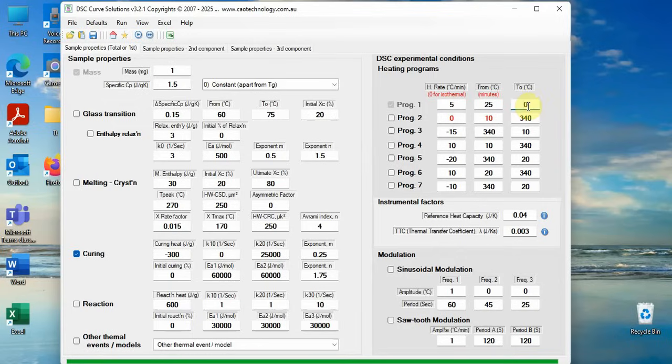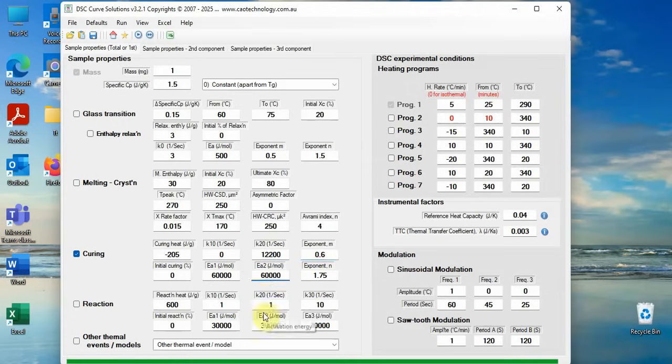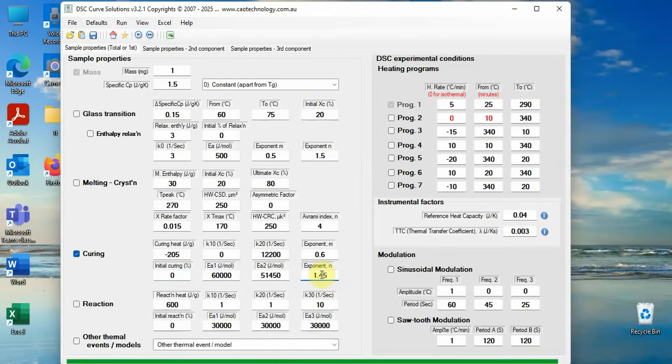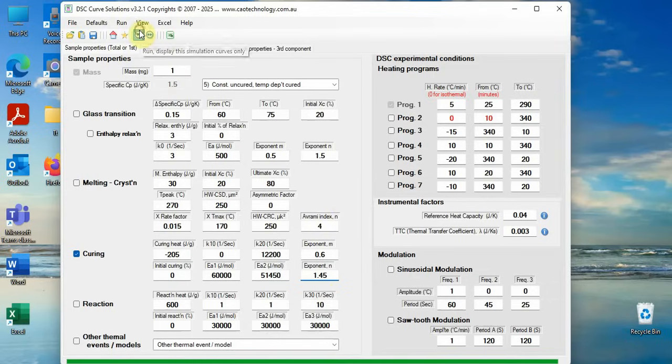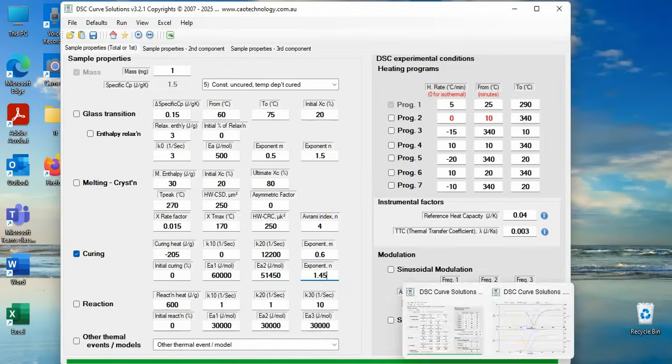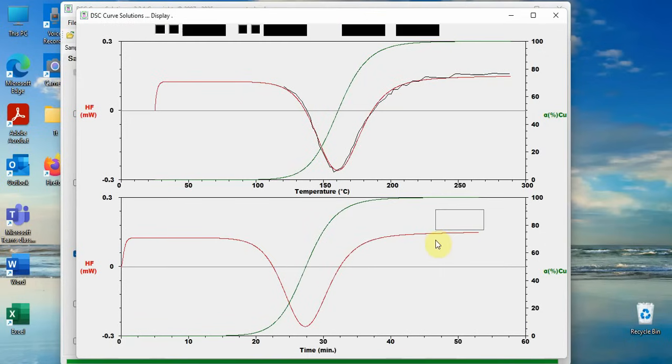You then adjust the parameter according to how simulated DCS curve departs from the DSC black curve. Trial and error until simulated curve matches the experiment curve. All the curing kinetics are then determined. The differential equation fully describes the curing behavior of the resin.